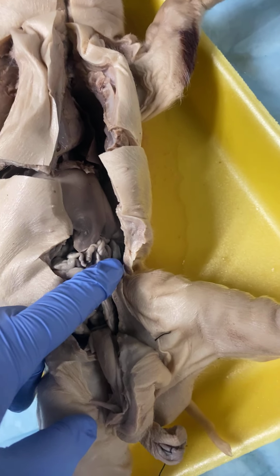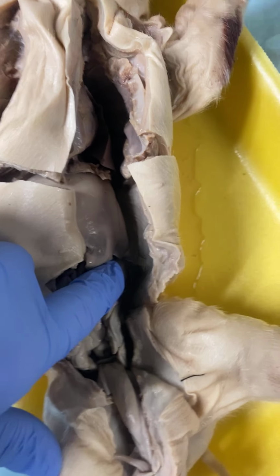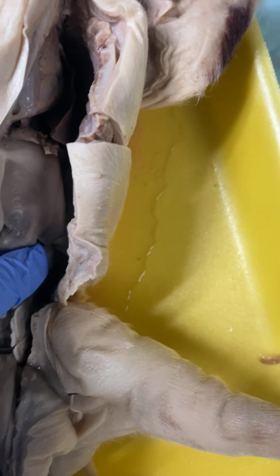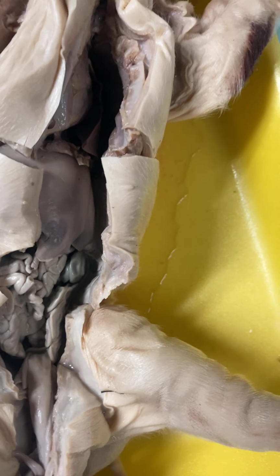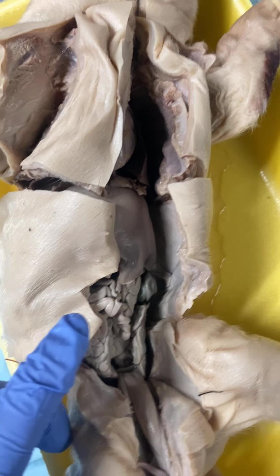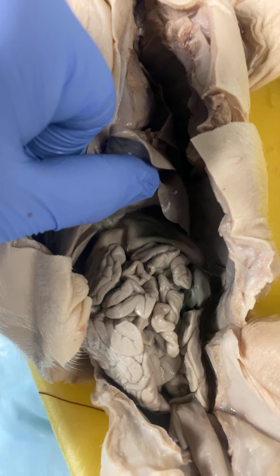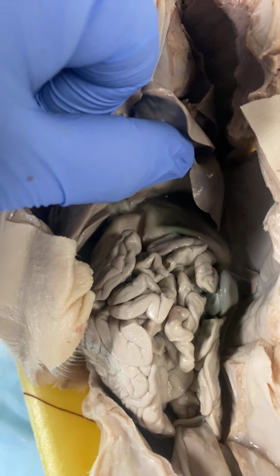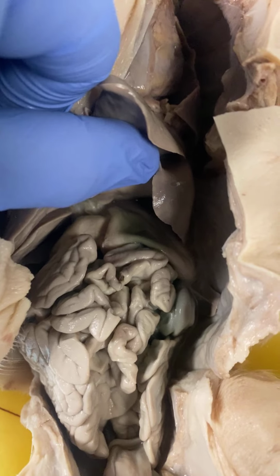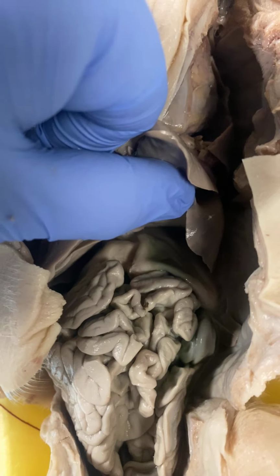Next, we have the kidneys, which is right here where my pointer finger is pointing. And the kidneys are an excretory organ that removes metabolic waste and produces urine, also critical in maintaining the balance of ions in the blood. Next is the pancreas. Okay. Next, the pancreas is the accessory gland with an endocrine portion that produces insulin and glucagon, and an exocrine portion that produces digestive enzymes.